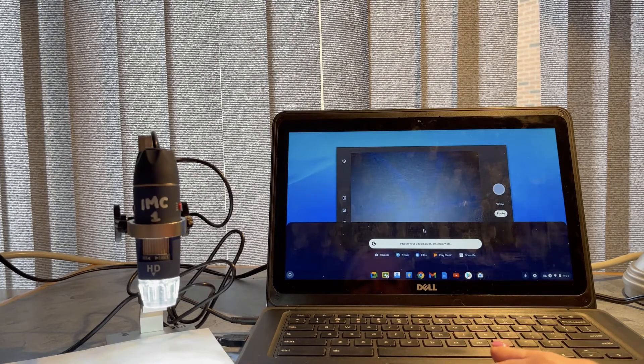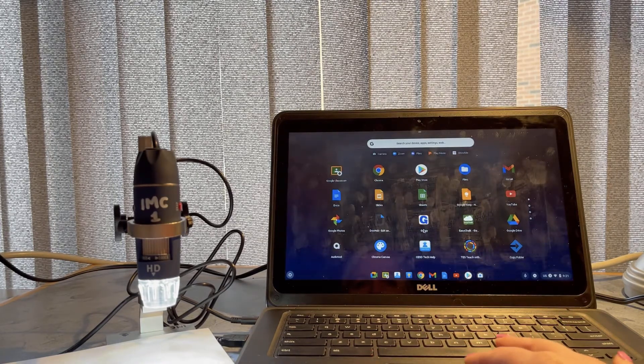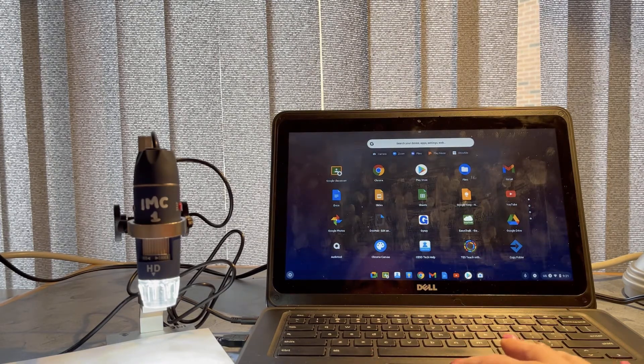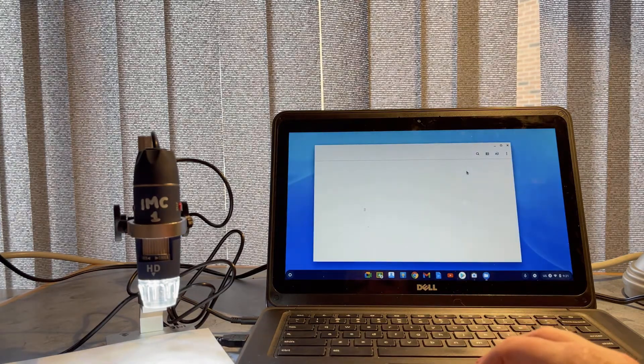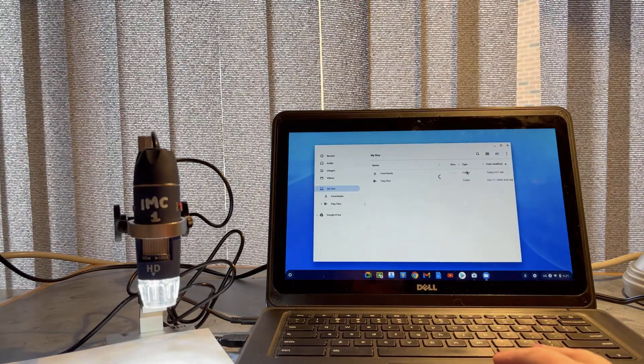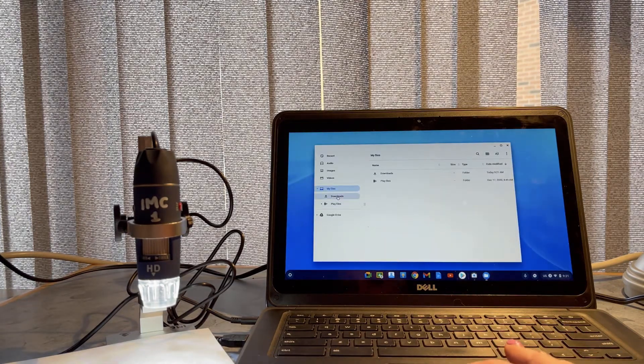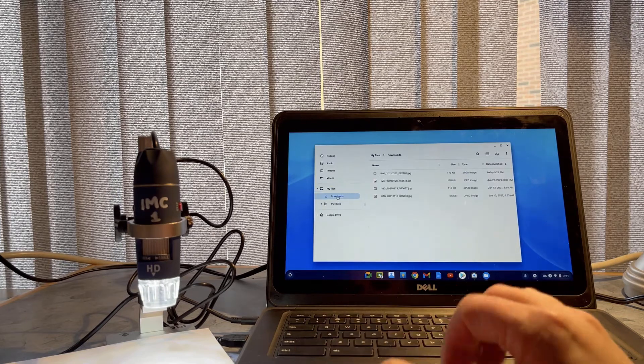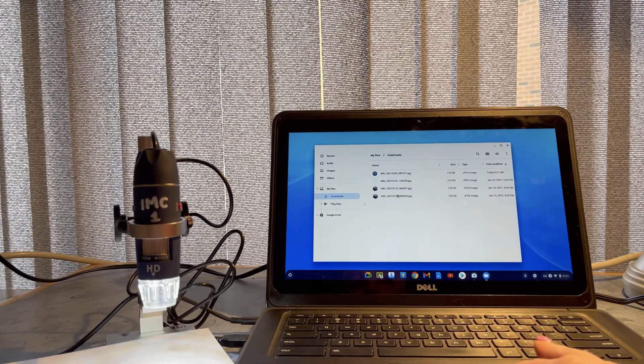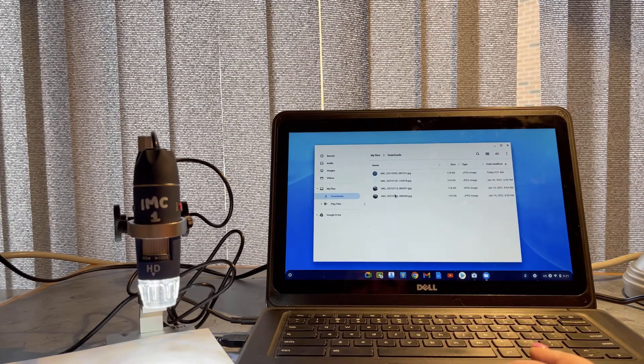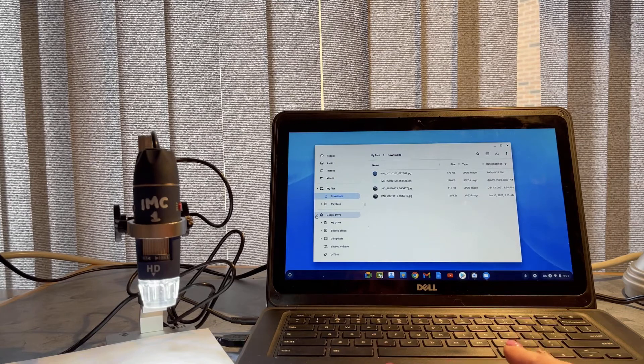I'm going to find them in the downloads folder on a Chromebook. There are the images that I've shot with my microscope. When I'm ready to put them into my Google Drive, whether I'm a student or a teacher, I'll just come over here.